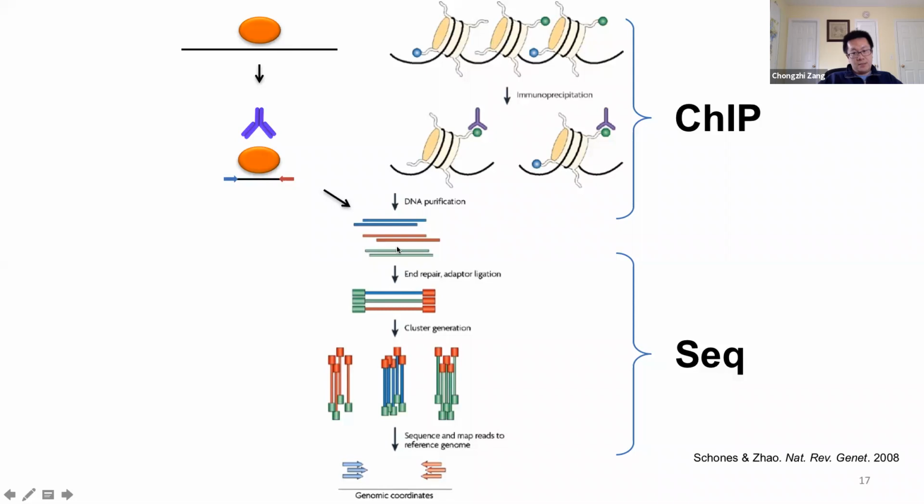That is determined by the next generation sequencing technology, or precisely Illumina technology. But in most cases, they can only guarantee to sequence one end of the DNA sequences. So depending on what sequencing technique we use, currently we can sequence either single end or paired end.